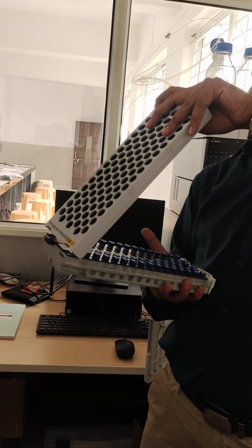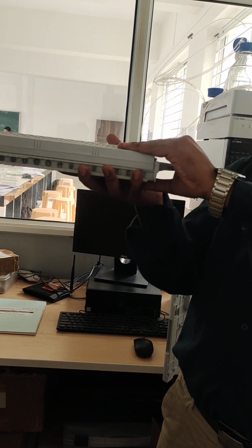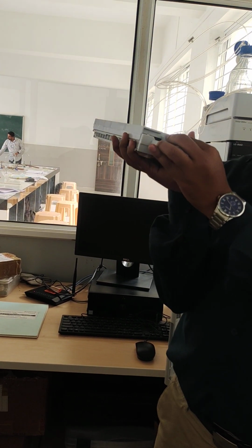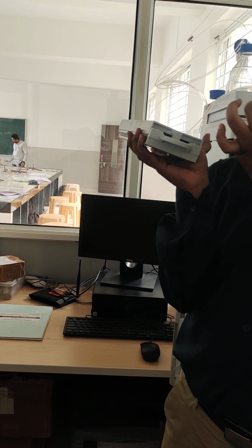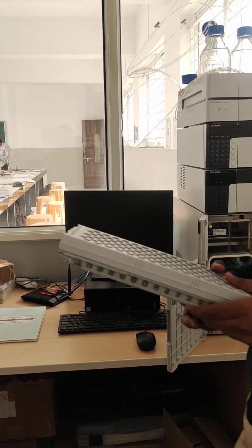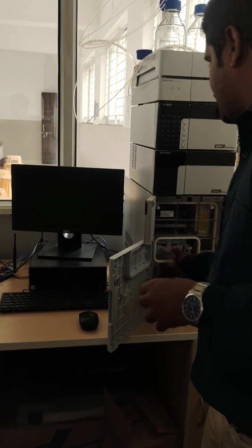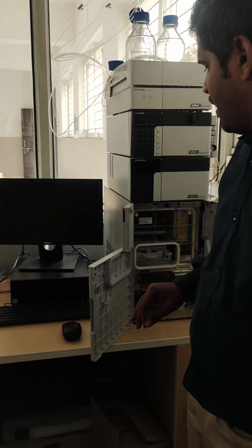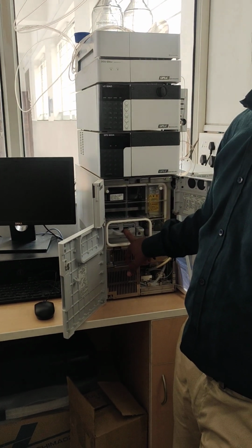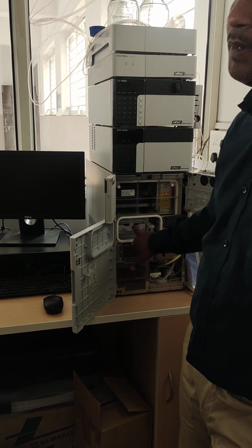Then if you are putting this in, we have the knobs and we will press this in such a way that we get some noise. Automatically we will confirm this is the fixed condition. Now we will keep this sample set into the sample compartment and push it in. Now it is fixed. We have filled the sample and fitted it there at the sample compartment.